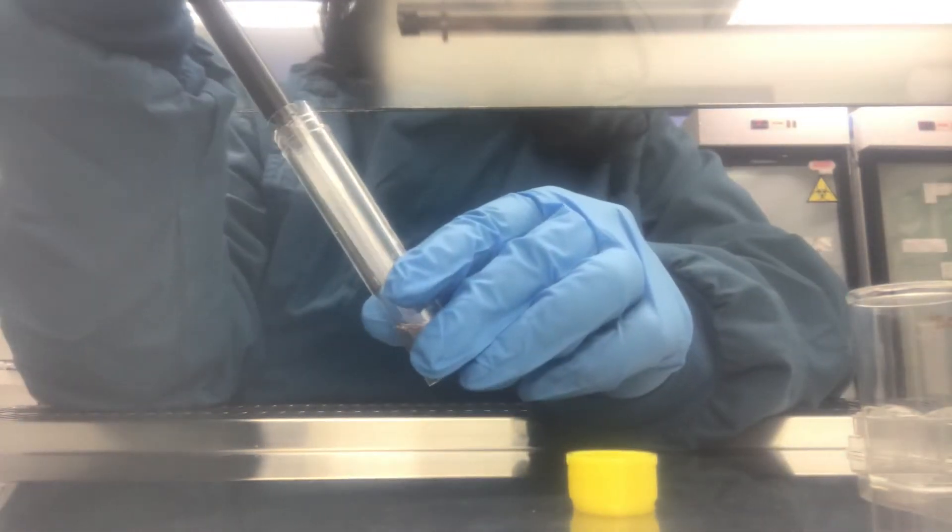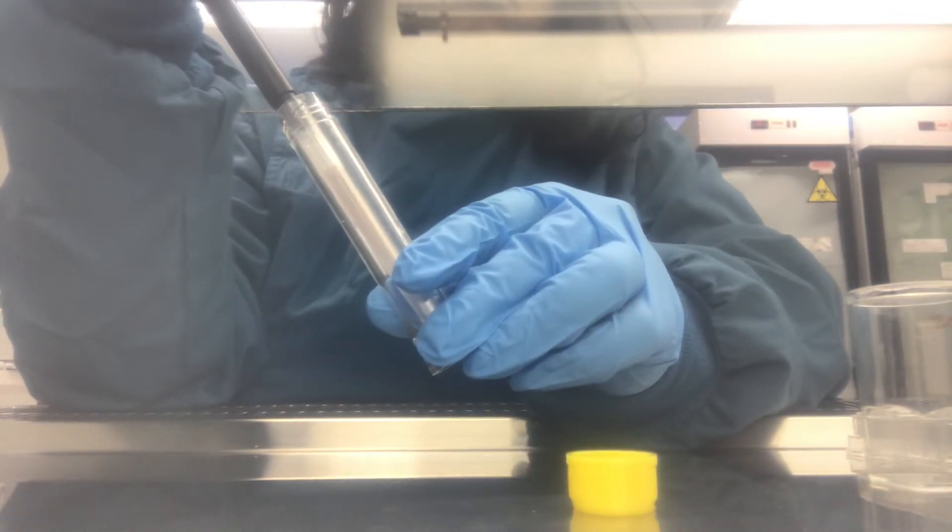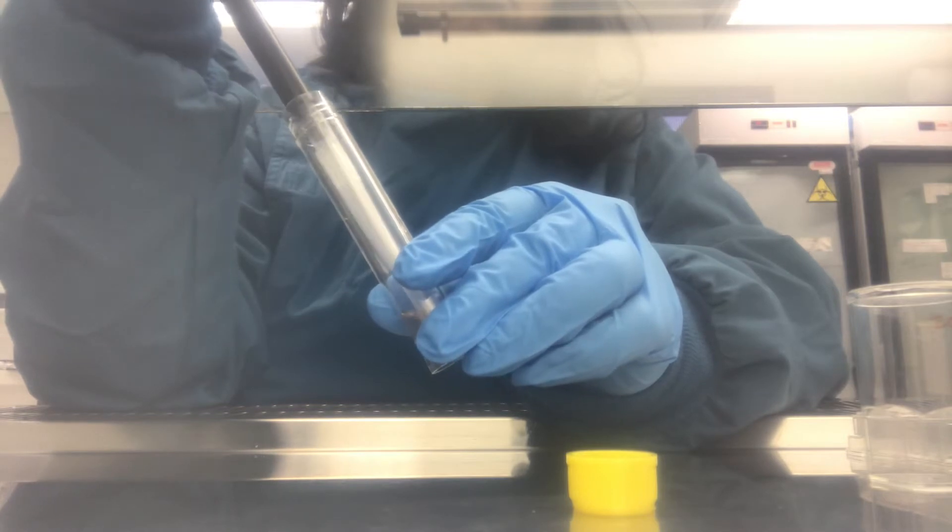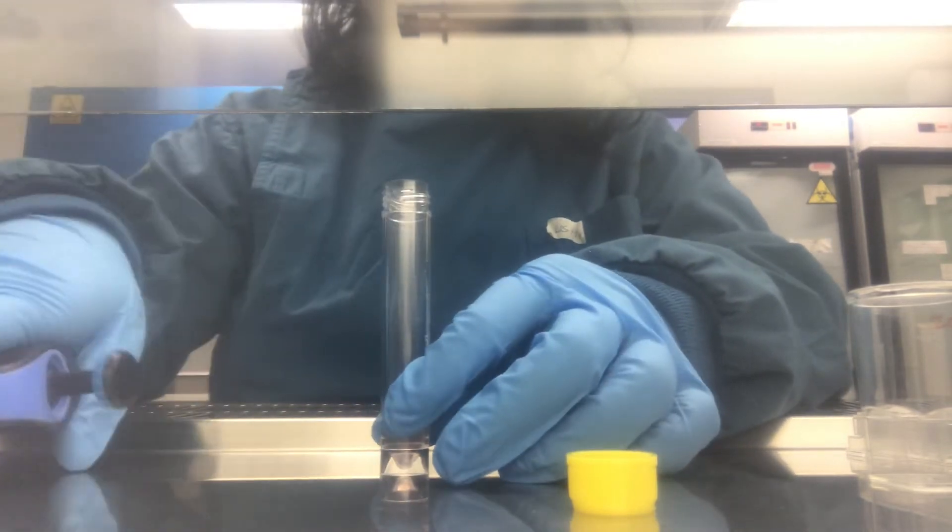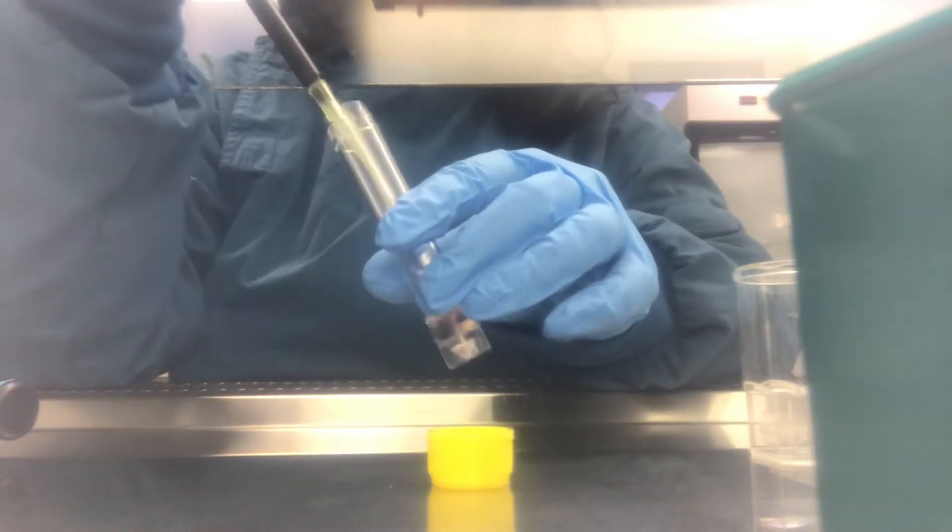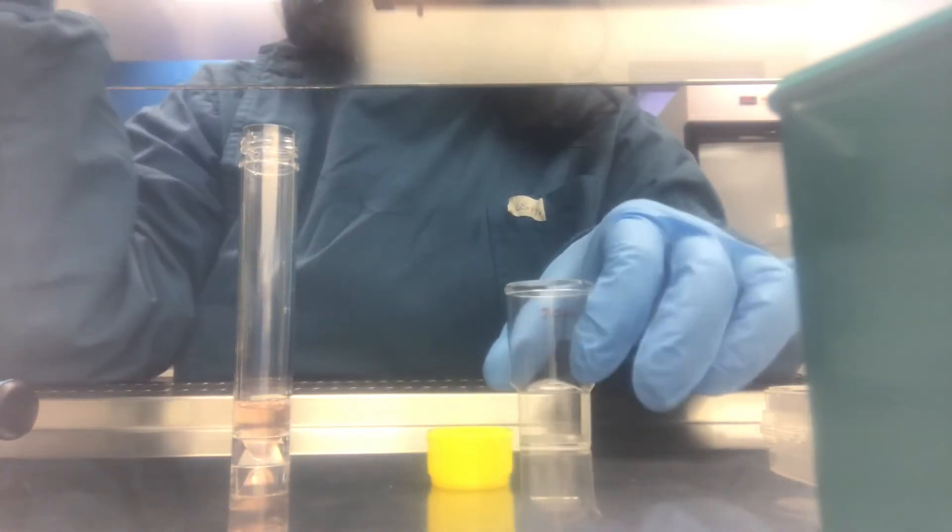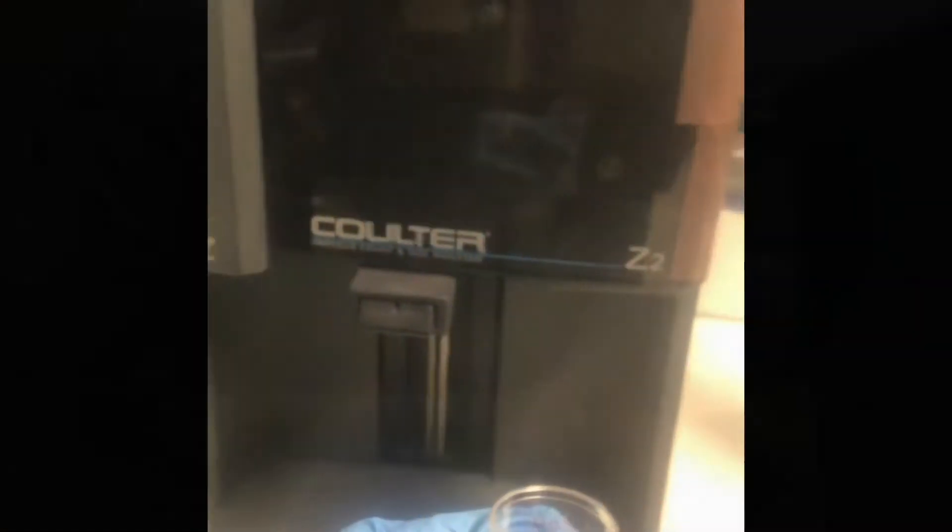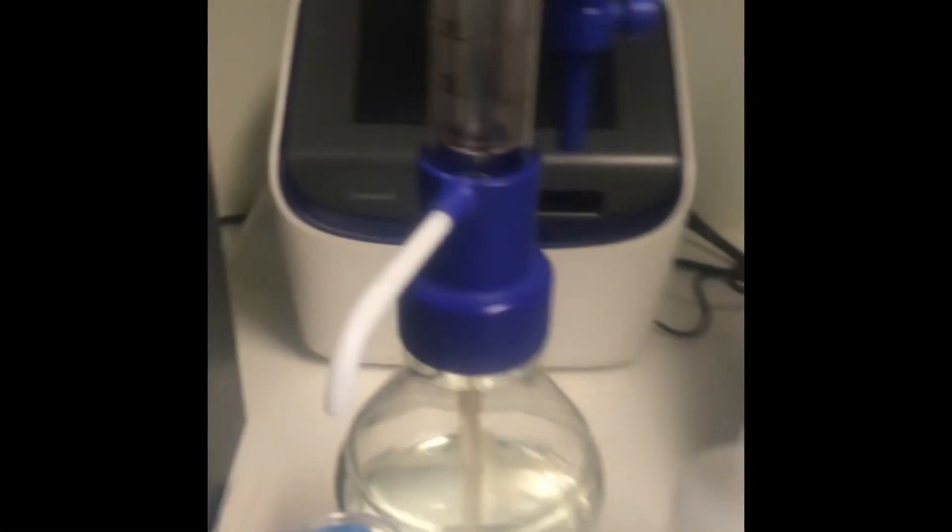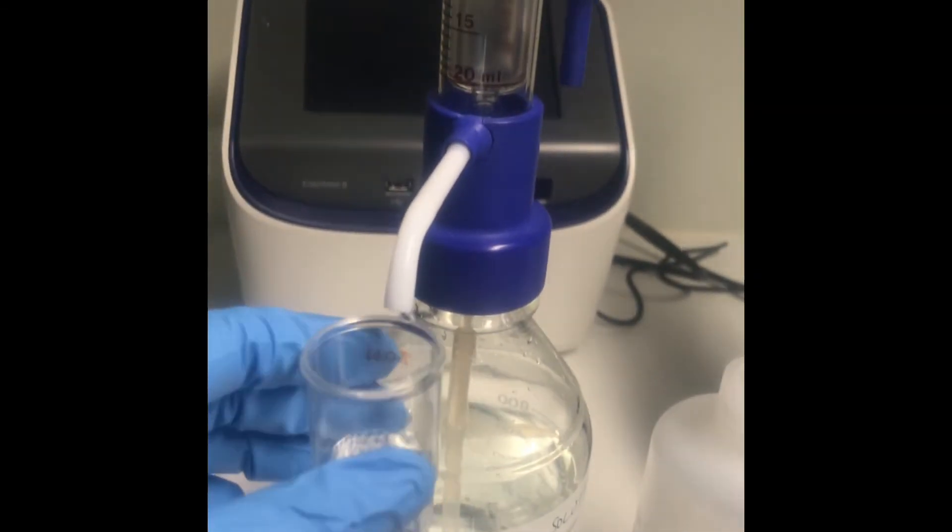I'm resuspending the pellet in one ml of fresh media which is at room temperature, and then I'm collecting only 20 microliters for cell counting. Based on the size of the pellet, you can use either less or more of the media to count.